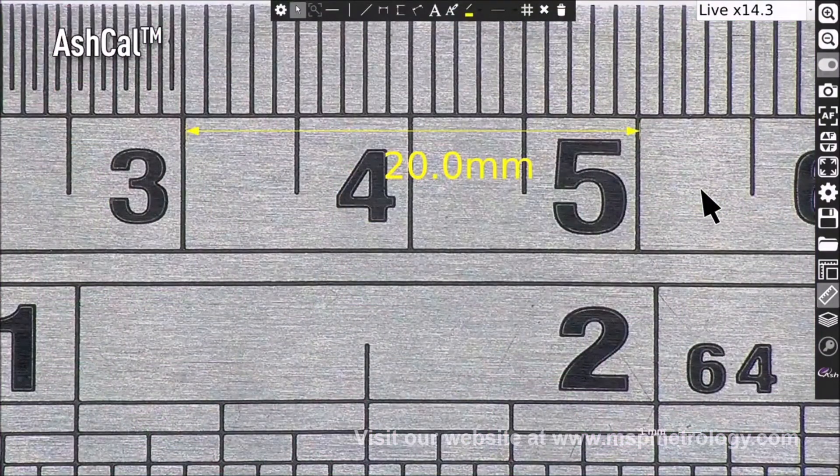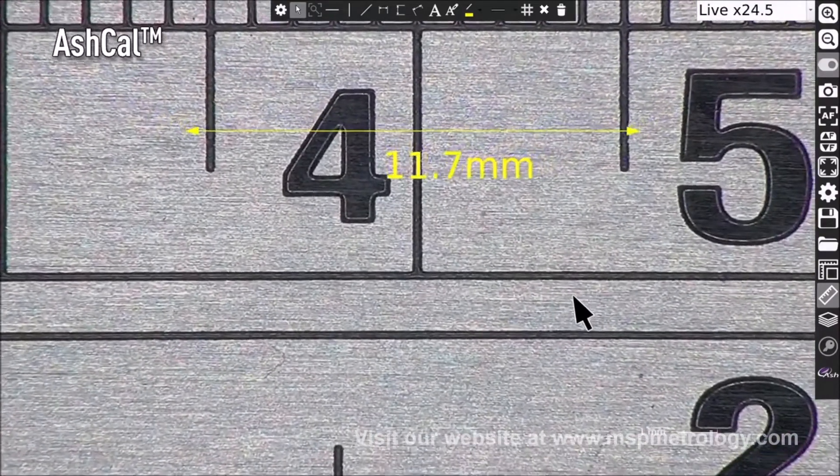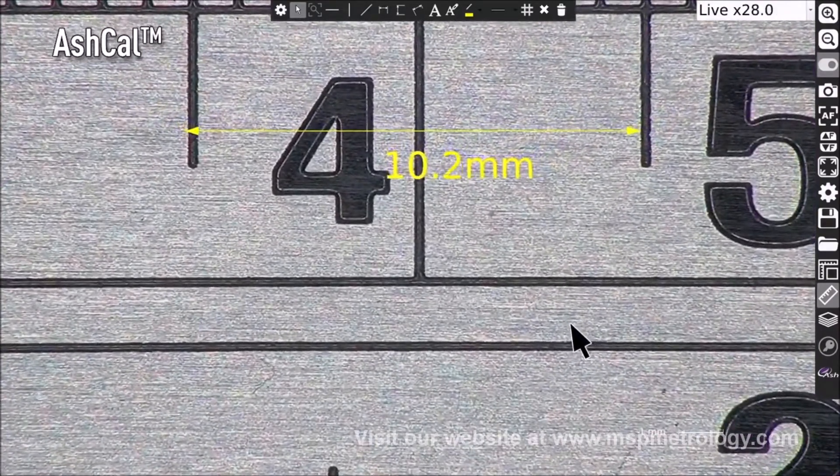ASHCAM, our unique calibration technology, is now enhanced, tracking and adjusting to any zoom changes without the need for time consuming recalibrations. The InSpecs 3 continually maintains calibration, saving time and increasing efficiency.